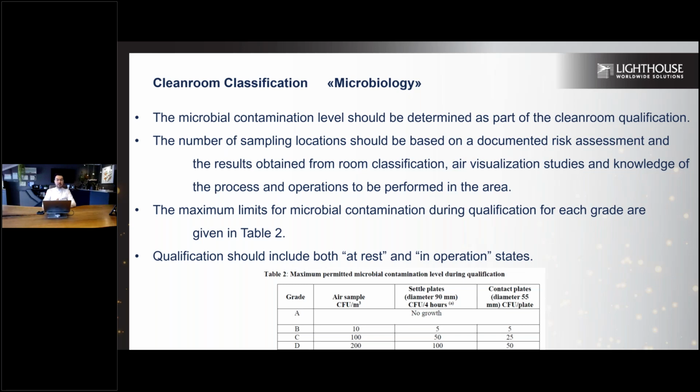Microbiological sampling points are always changing in your clean room because the dynamics can change. So once you have the specific locations, please make sure you are revisiting these locations and aligning them with the current clean room working structure. Sometimes even the equipment locations or the personnel flow within the clean room change, but your microbiological sampling location stays the same. So it does not really represent the risk-based approach of your process.